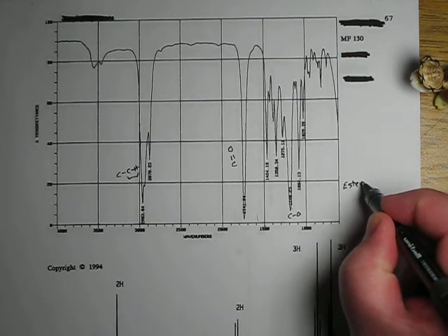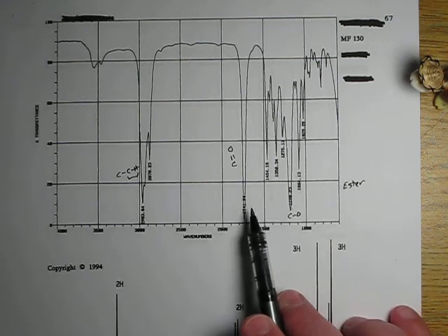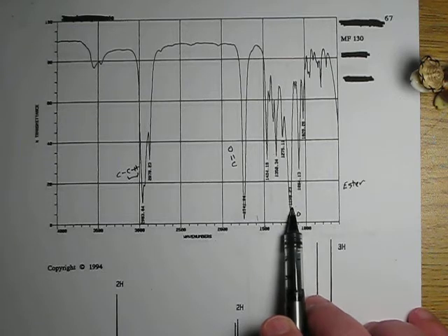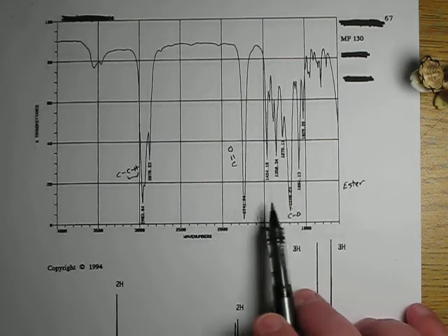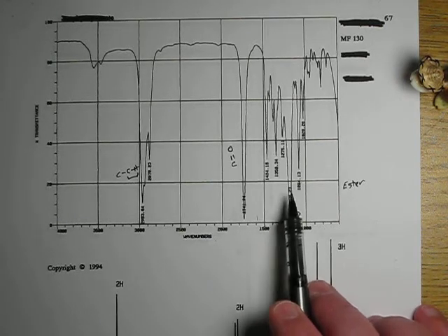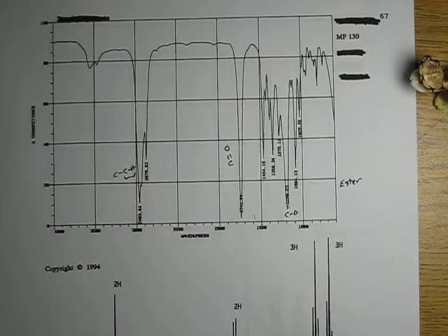I have seen this pattern before where I have two peaks that are a little bit broad, one at 17-something, one between 1000 and 1200 wave numbers. This just looks to me like ester. I could be wrong, but that's a pretty sizable peak to be similar in size to the carbonyl peak. So I'm looking at that.